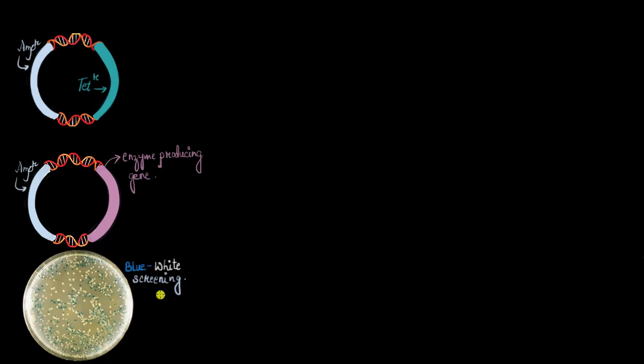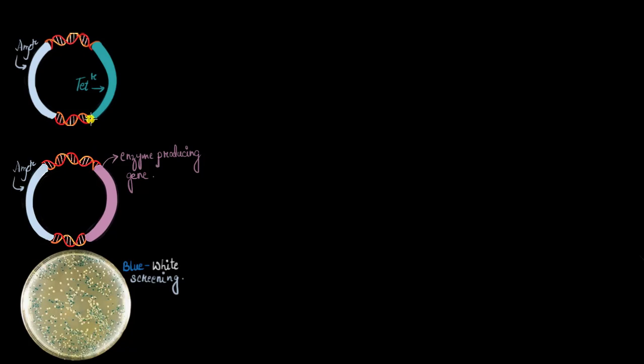So in this video, let's discuss what a blue-white screening is, how an enzyme-producing gene can be used as a selectable marker, and in which way is this method easier and quicker than the one we already discussed. Let's begin by discussing the need to screen different bacterial colonies. What is the need to do that in the first place?